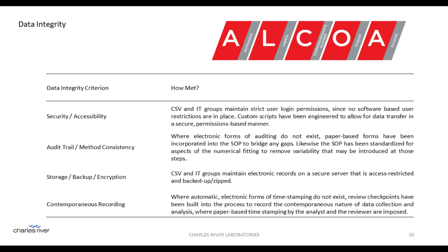Importantly, as I show here in a few bullet points, CSV and IT groups can implement layers of security through add-on scripts to ensure accessibility restrictions to the software, adding a layer of security where the software may presently be lacking. The custom scripts can also be added to make sure primary raw data, once generated, is automatically moved and is stored read-only in a way that requires very little intervention or interaction from the analyst, the one who is logged in on the computer. We make this easier and secure through custom scripts.